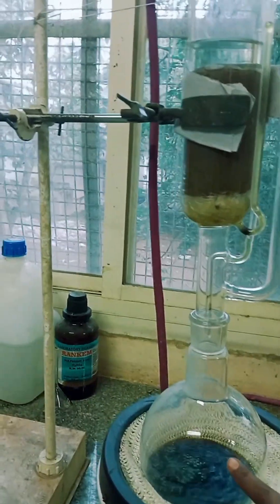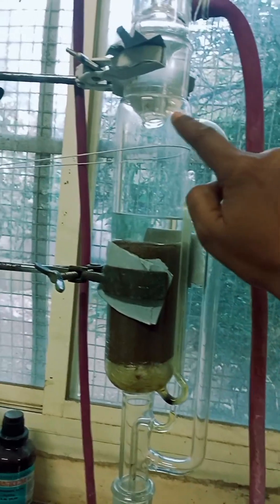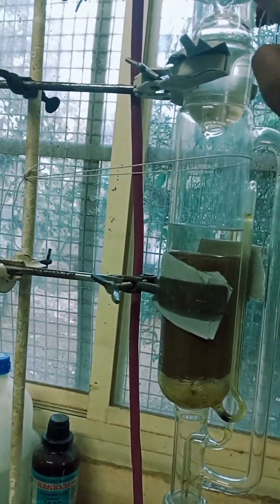Basically, what happens here is that the solvent will heat. This solvent will be converted into vapor and will pass through the condenser. The condenser then converts the vapor back through condensation.